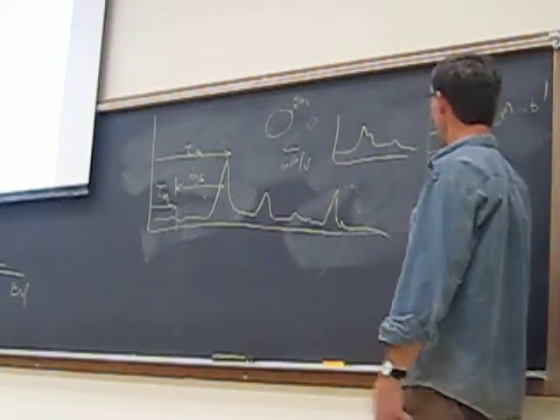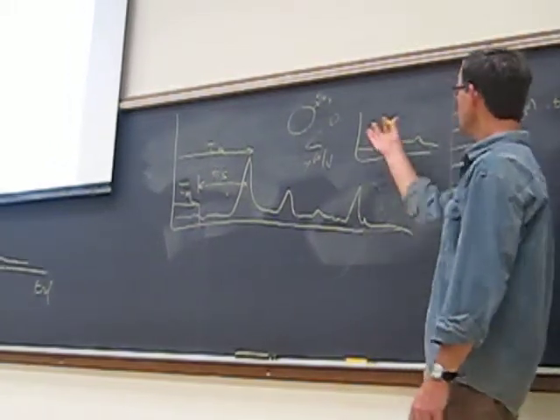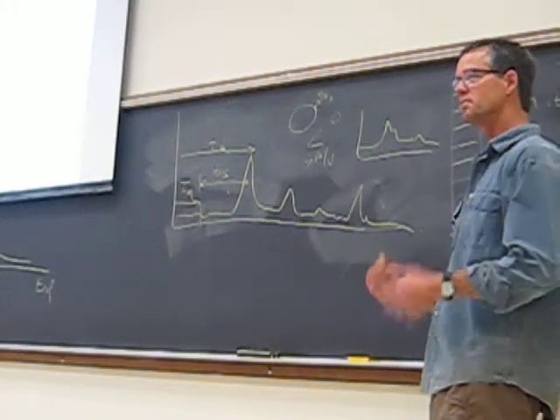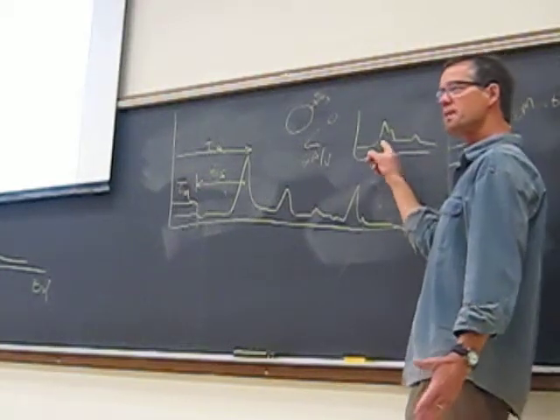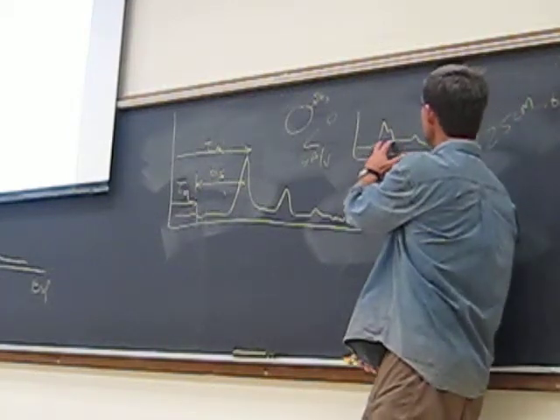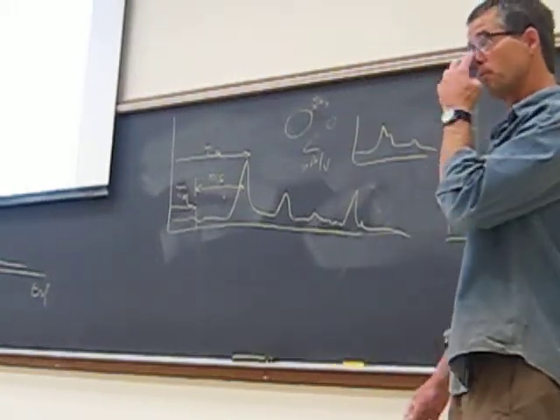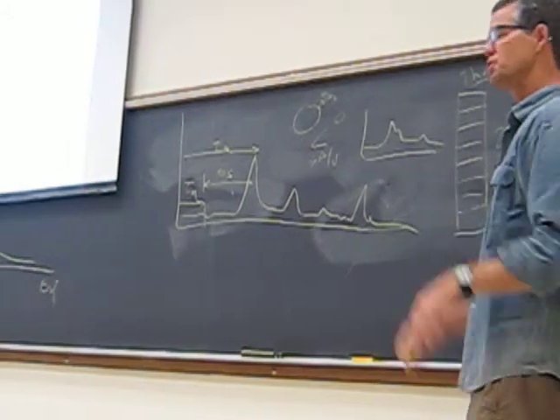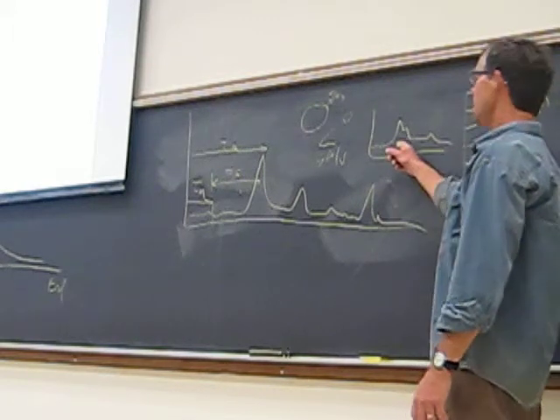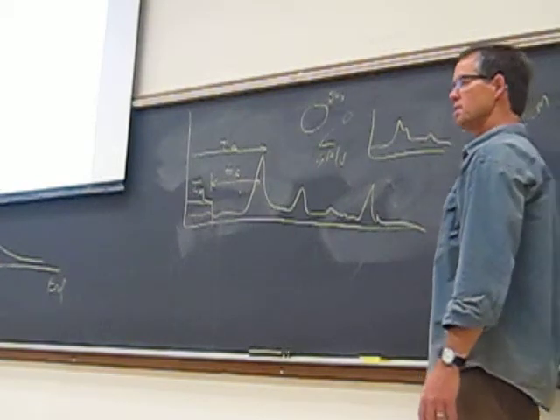And so you'd say, well, I would first maybe try to reduce my plate height, by reducing the particle size in the column to increase the surface area upon which the analytes are partitioning. I might change the properties of my mobile phase, and I might try to see if I can separate these by changing the pH or the ionic strength or the organic composition, if it has a non-polar or polar organic solvent in it. I would play with these empirically to see if I can change and optimize that separation. Have a sense of that?